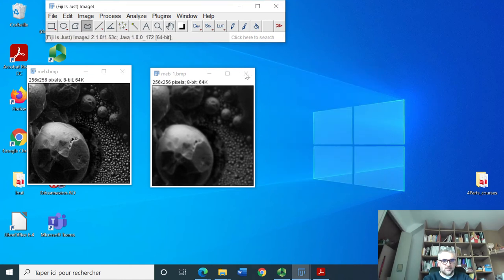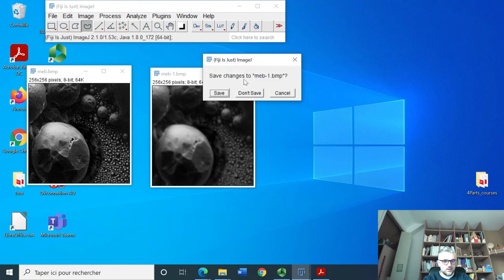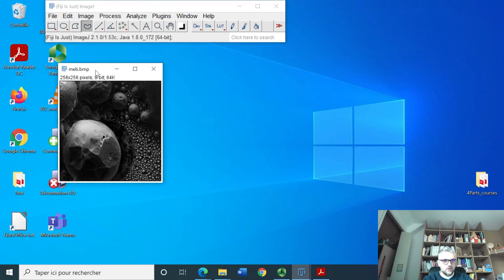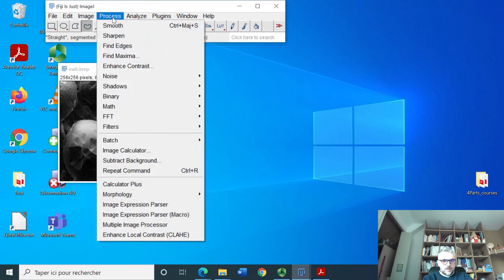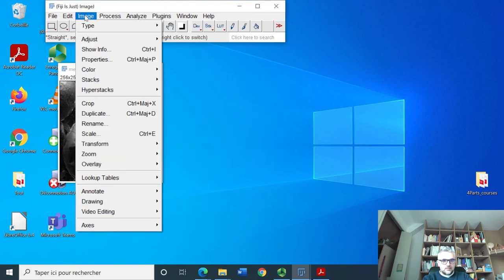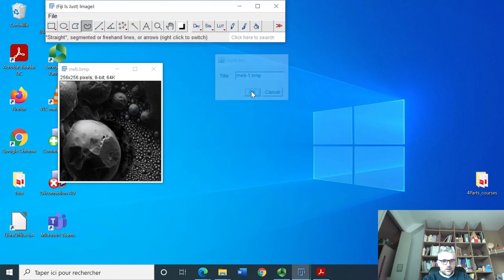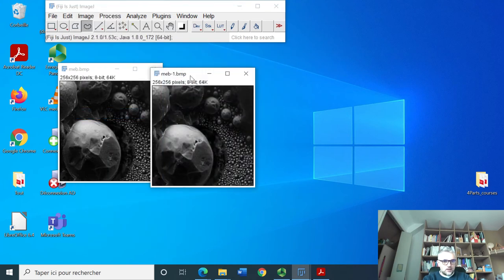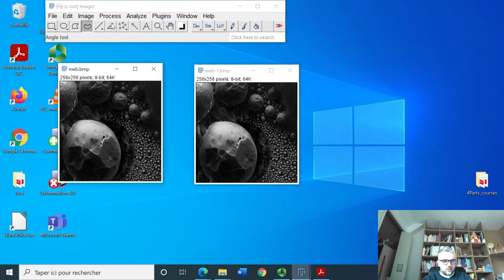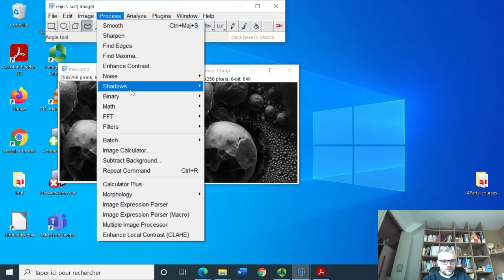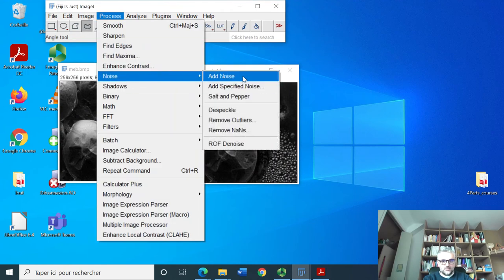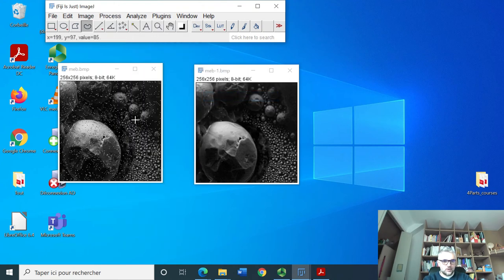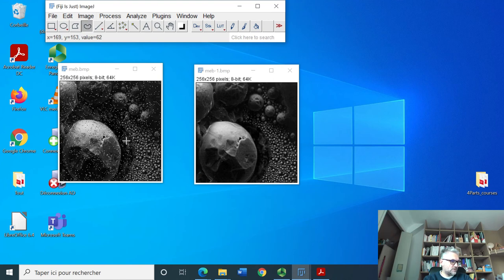Now if we duplicate again this image we will take one where we will add noise, salt and pepper noise. This kind of noise. We duplicate this image so we're going to make the same here, duplicate salt pepper.